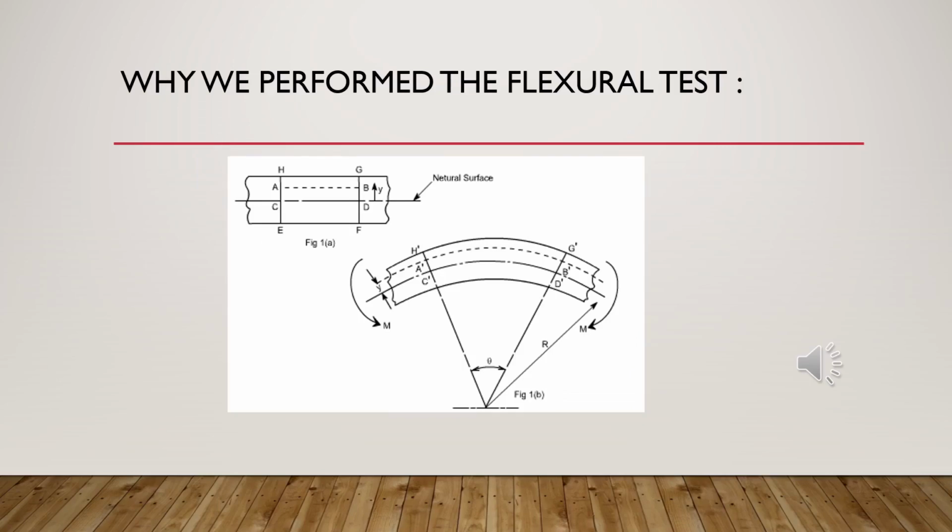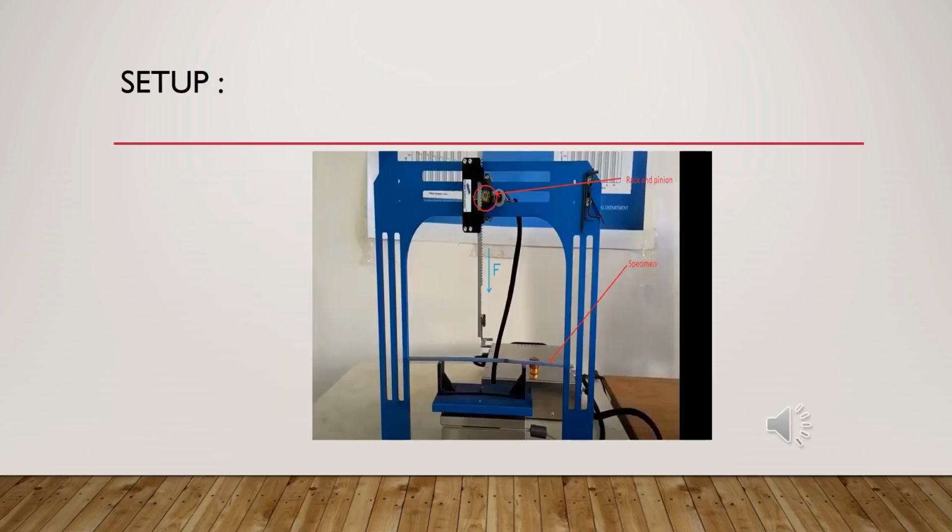High flexural strength is essential for stress bearing restorations when high pressure is exerted on the material or a restoration. As a result, flexural strength also determines the indications for which a material can be used. The more strength the material offers, the more units a restoration can include.